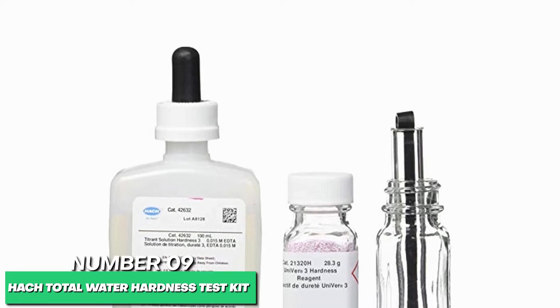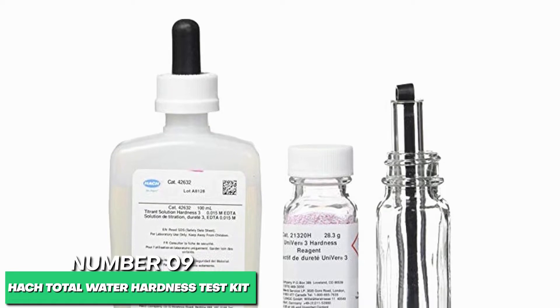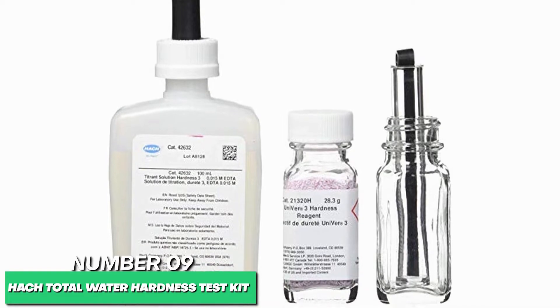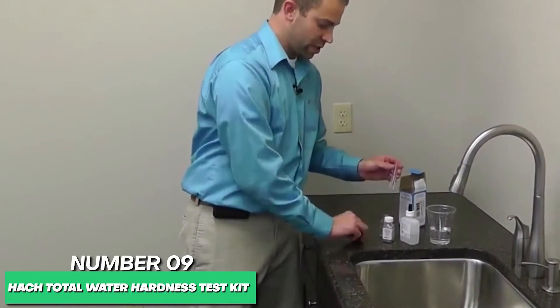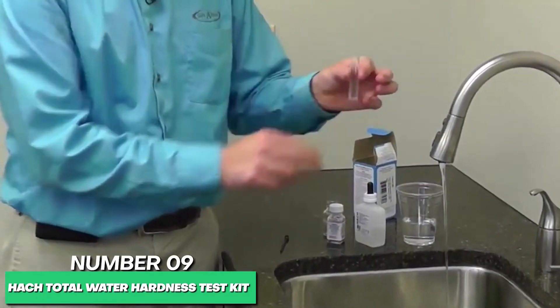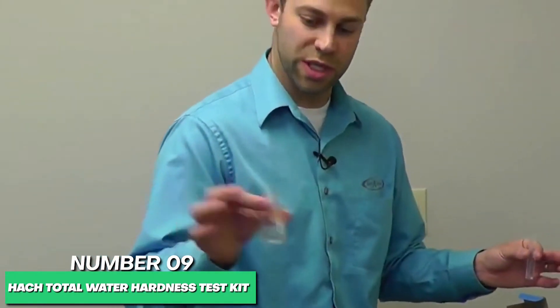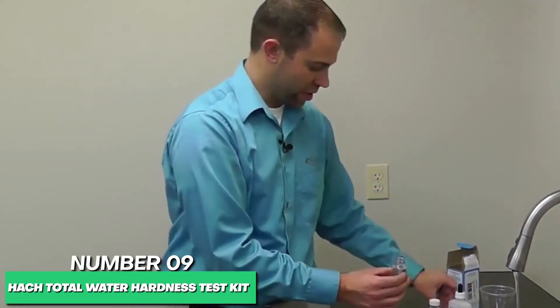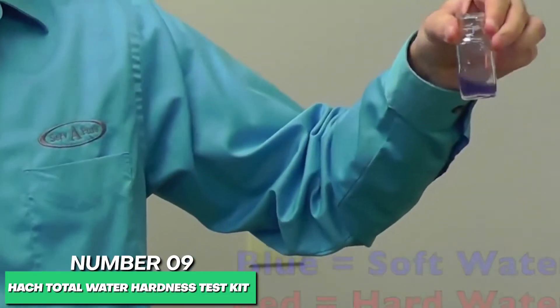Hard water does not play fairly. The Hatch Hardness Test Kit helps you keep hard water at bay and from interfering with soaps and detergents, which cling to your dishes and wreak havoc on your water-powered appliances. If your clothes look faded or your glassware is cloudy, odds are that hard water deposits of calcium carbonate, calcium sulfate, and magnesium hydroxide are flowing through your home's water pipes.